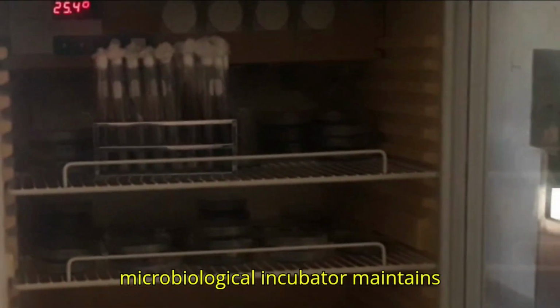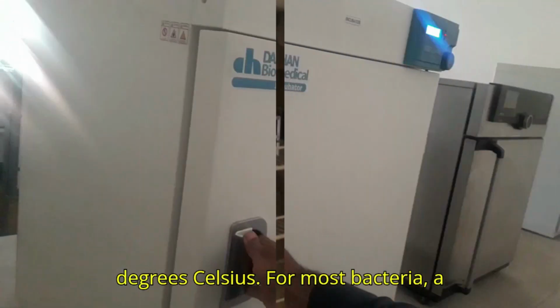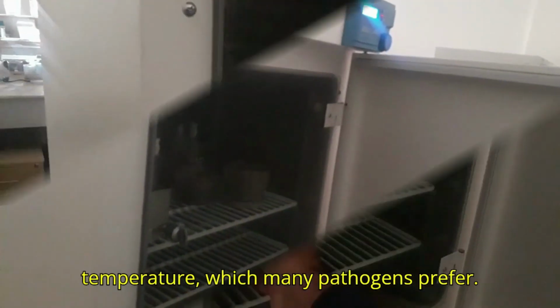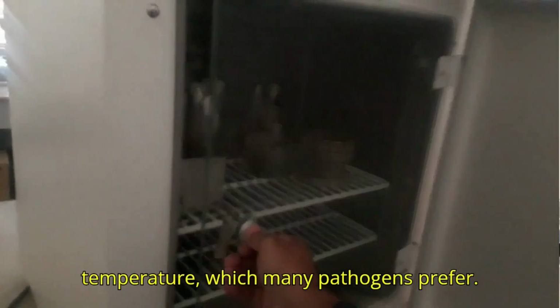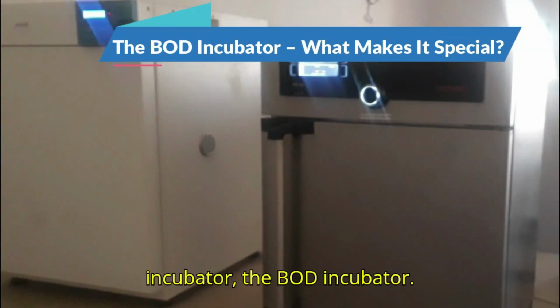Typically, a microbiological incubator maintains temperatures between 20 degrees and 45 degrees Celsius. For most bacteria, a temperature around 37 degrees Celsius is optimal because it's close to the human body temperature, which many pathogens prefer. Now let's talk about a special type of incubator, the BOD incubator.